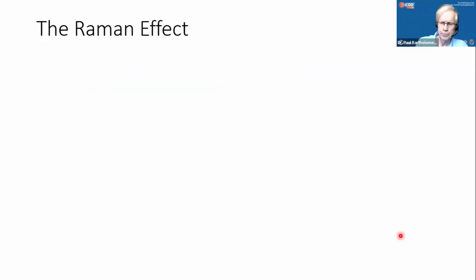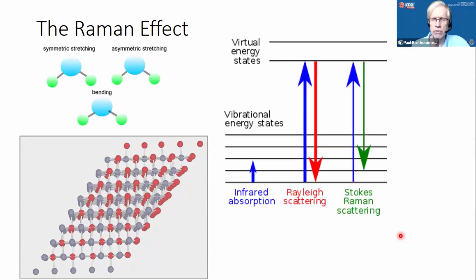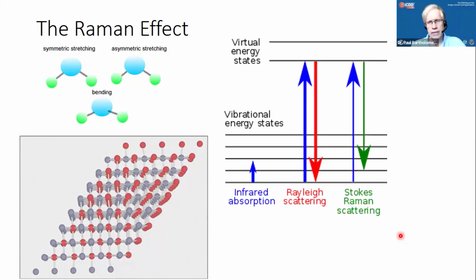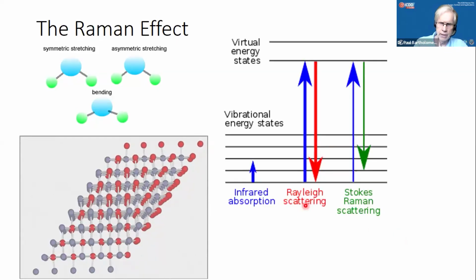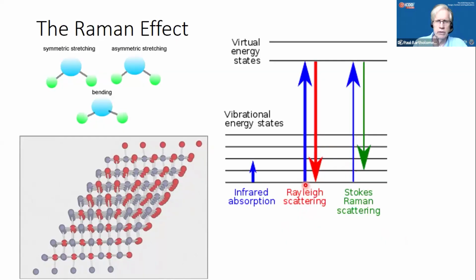The Raman effect is connected to the quantized energy levels of interatomic vibrations. Same phenomena happens in a crystalline matrix. Vibrations just have a little fewer degrees of freedom. Like any spectroscopy, we send an exciting signal to the sample, in this case, visible light, and yes, into the infrared, and it can be into the ultraviolet as well.